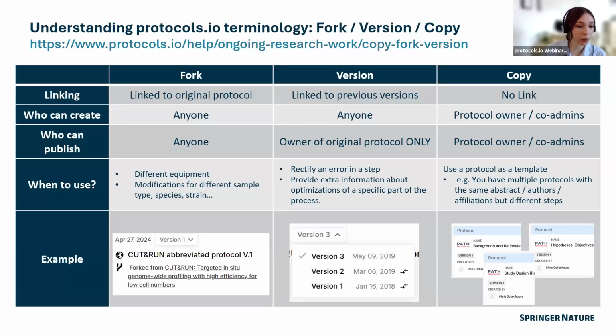And this is what it looks like on the platform. You can see that the link back to the original protocol is always maintained, so the original protocol developer can get credit for that.